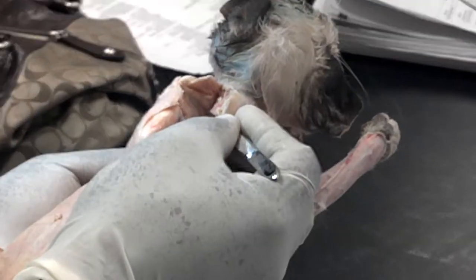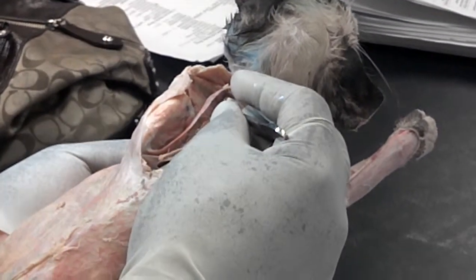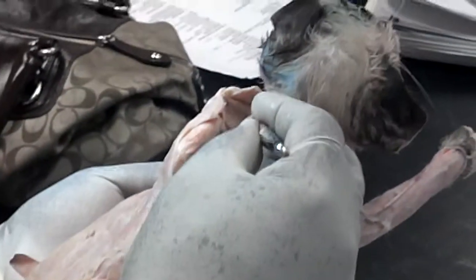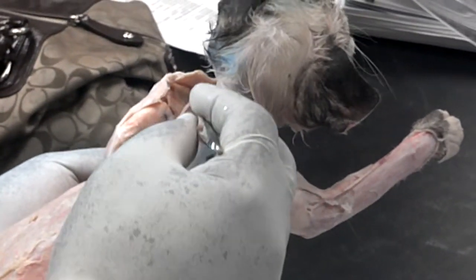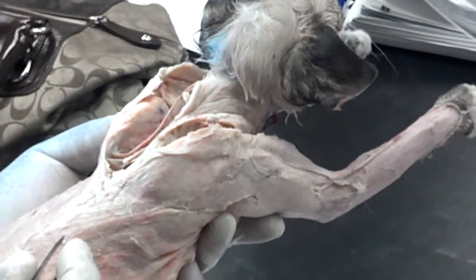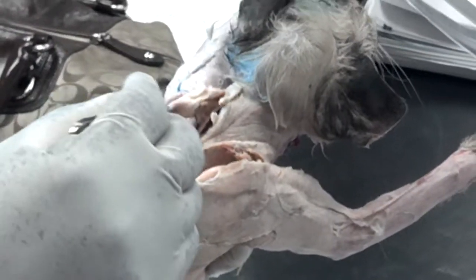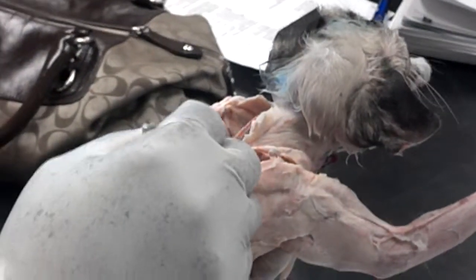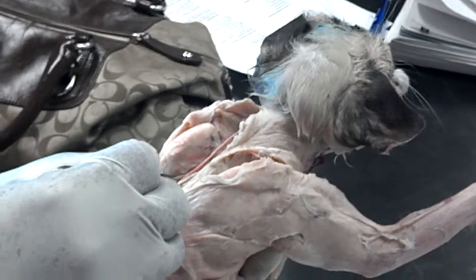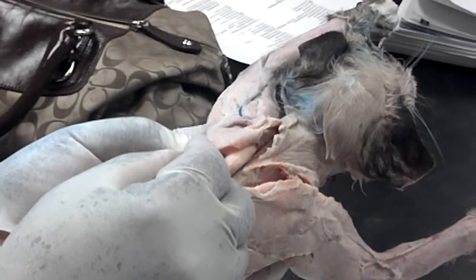That's the rhomboideus capitis. Now, wrapped around the neck over here, that's the splenius under the rhomboideus capitis. That's the splenius. And what else we need to see over here? I think that's it, right? Rhomboideus capitis, splenius, and rhomboideus group. And we saw this one. This is the supraspinatus.